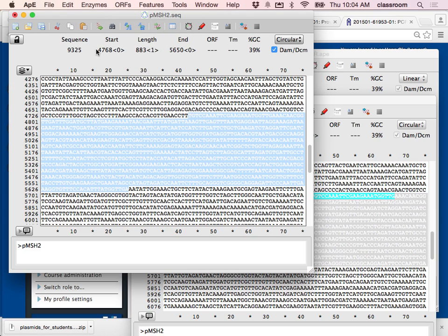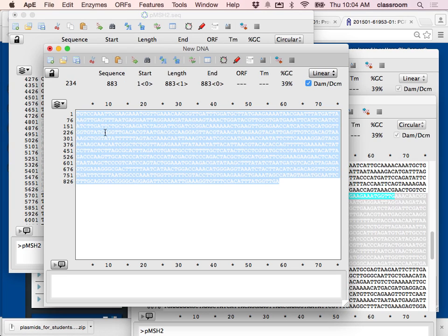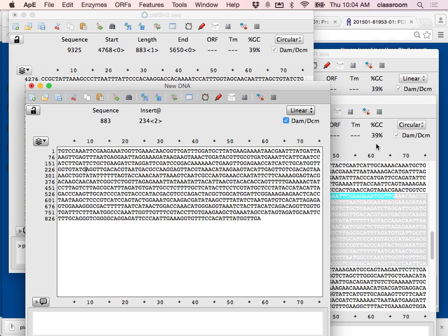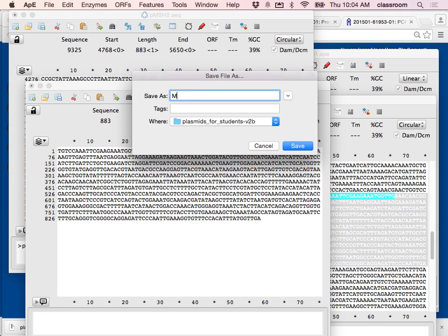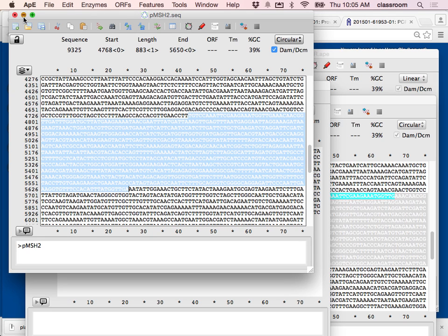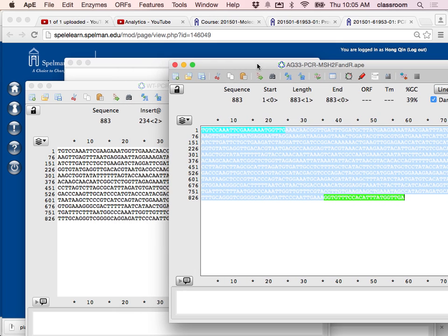I paste it to create a new file and save it as the wild type MSH2 — MSH2 should be uppercase — wild type forward and reverse PCR product. I minimize the plasmid windows and just look at the two PCR products.